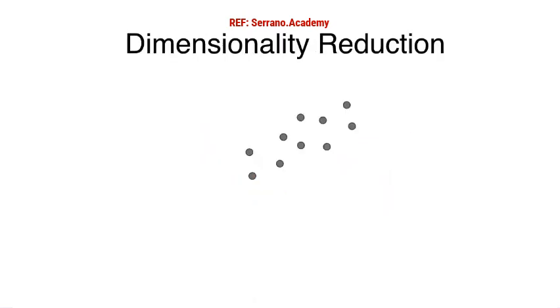So when your data looks like this, then a picture of the data could be, for example, projecting it over this line. Then you get these points over here. Another one could be projecting it over this line. Now the question is, intuitively, which of the two projections seems better? Let's compare them, put them side by side.